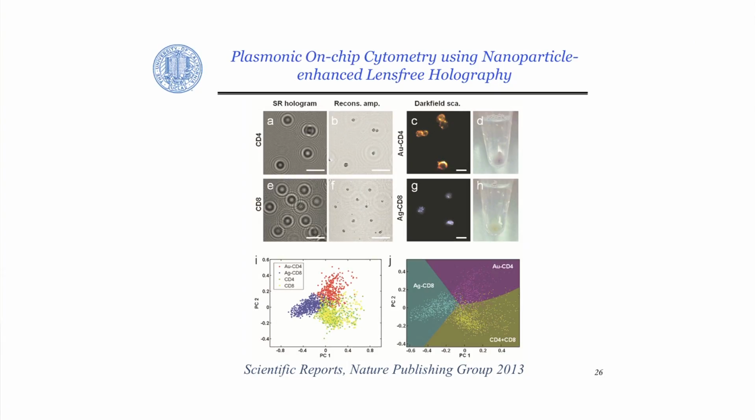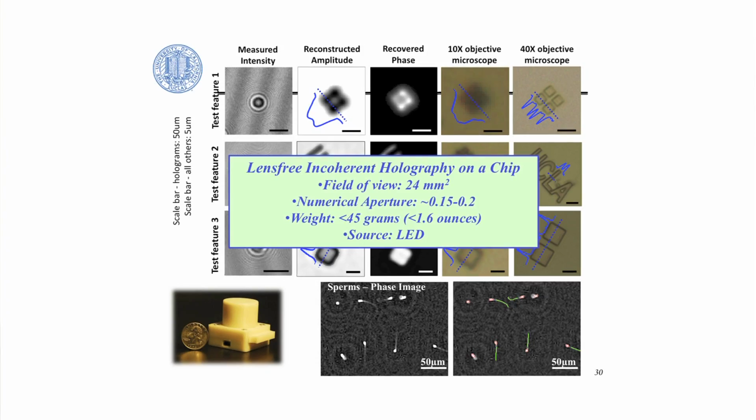And of course, water quality screening is another application for these microscopes. I'll skip this part because there are different technologies that I'll introduce, but because water screening requires large volumes to be imaged, lens-free imaging provides a unique advantage because lens-free imaging has a very large field of view. For instance, this design, although it's got a limited resolution on the order of 1 to 2 microns, has a field of view that's on the order of 24 millimeters square.